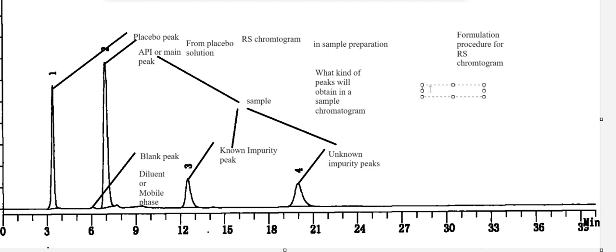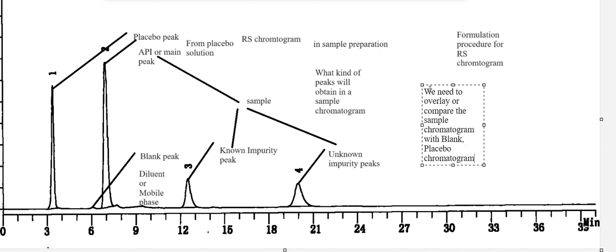To know that, we need to overlay or compare the sample chromatogram with the blank and placebo chromatograms.